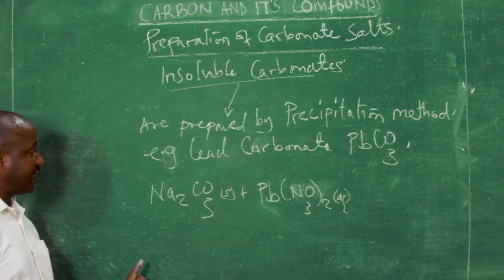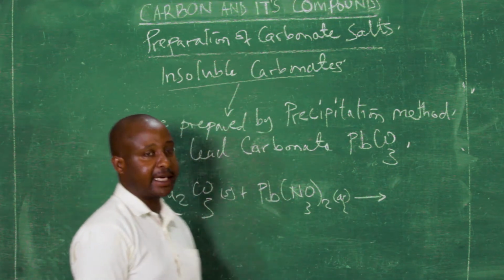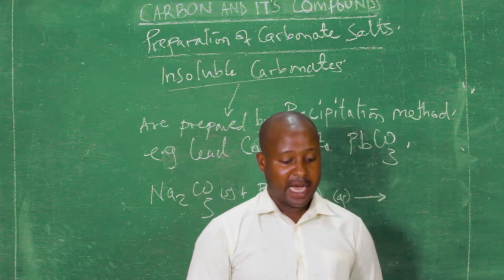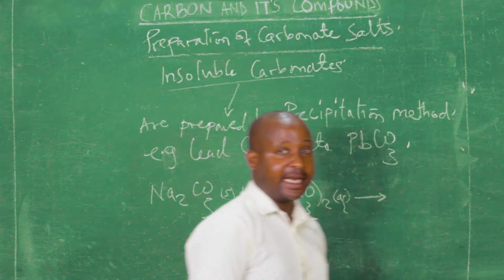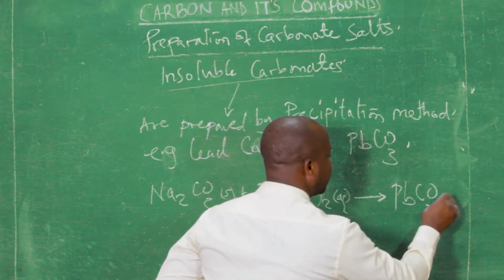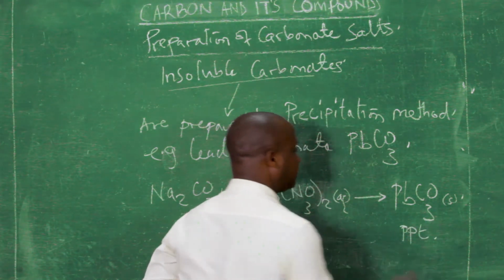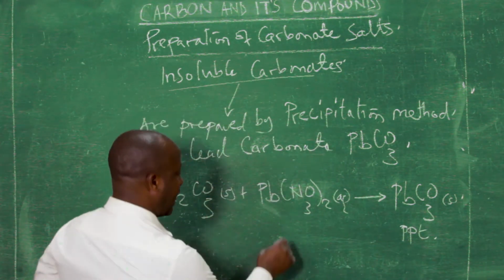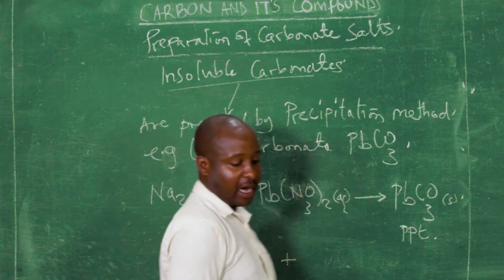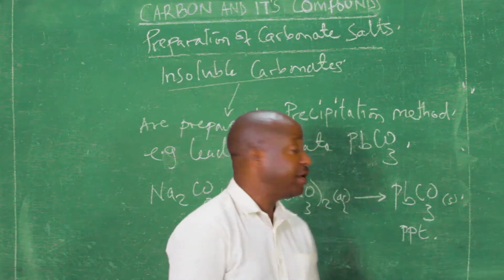what we shall get at the end of the day is a precipitate. And this precipitate is lead carbonate. In addition, sodium nitrate will also be produced.